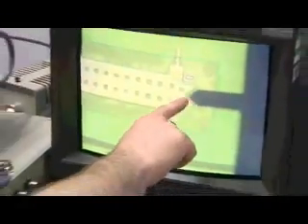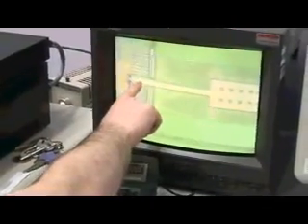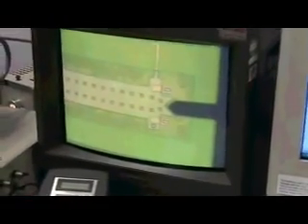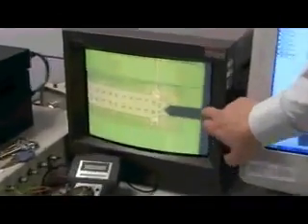So Greg's actually working on a project with the National Physical Laboratory, where Greg is designing a new type of probe, that I was just talking about with the needle, and trying to design one that's better for the kind of work that we do. So this is a collaboration between us and physical sciences, which is something we like to do. Actually, this scale is not that small. This is just an optical camera. Okay. But this needle that Greg was talking about, this has the very sharp nano needle behind it.